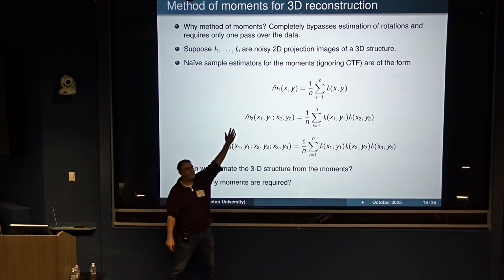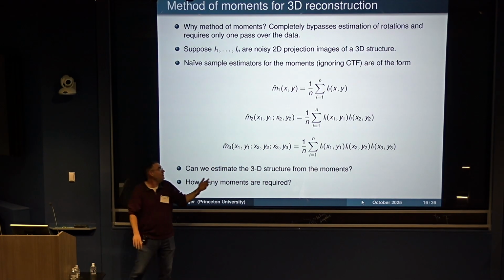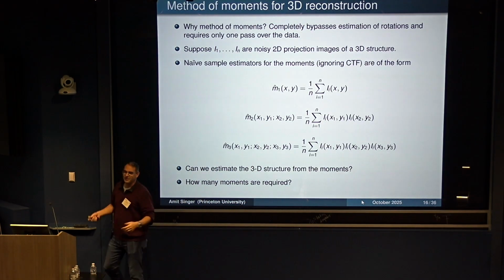Clearly, I cannot do it from the first moment. The first moment is just a 2D image. I cannot reconstruct a 3D structure from a 2D image. But maybe the second moment is enough. If not, maybe I need to go to the third moment. Who knows?